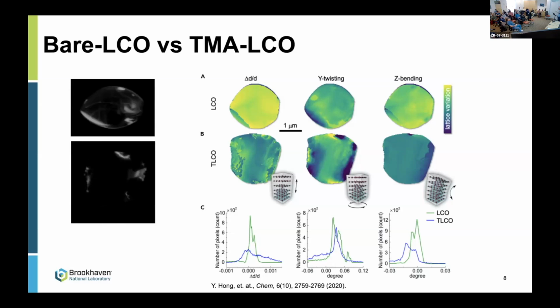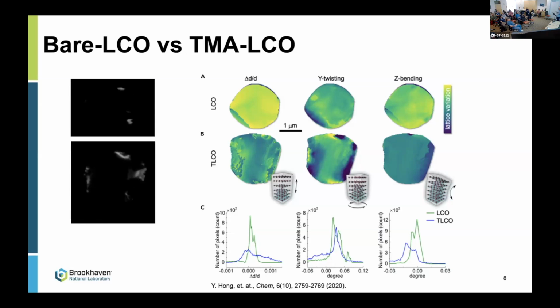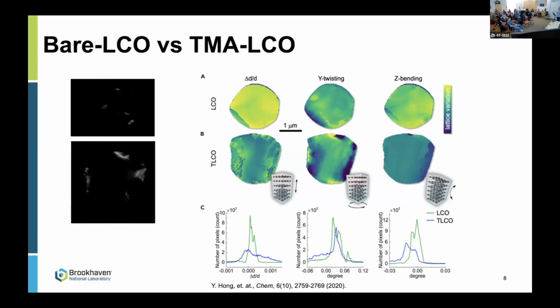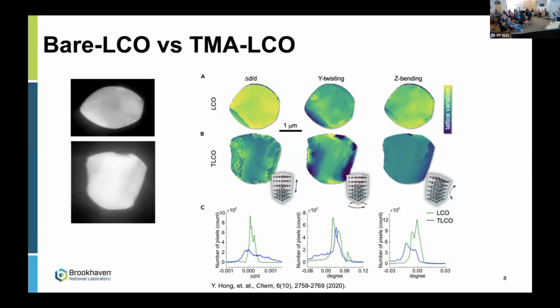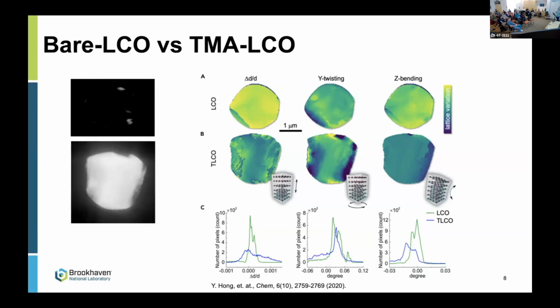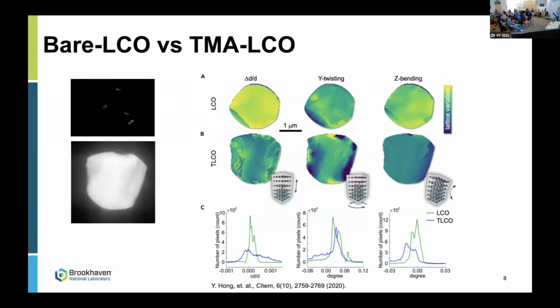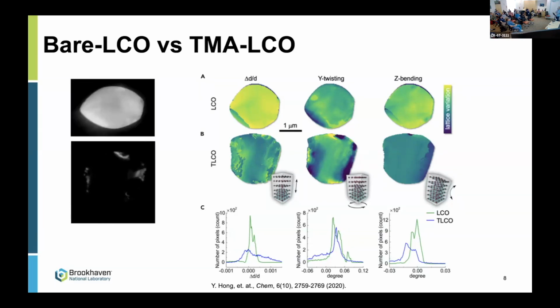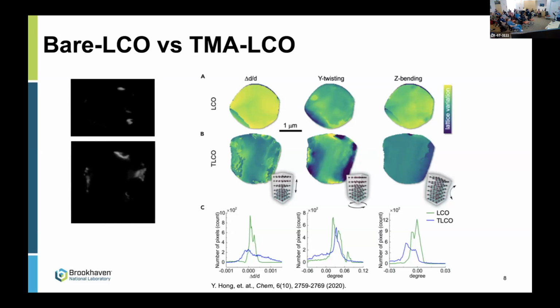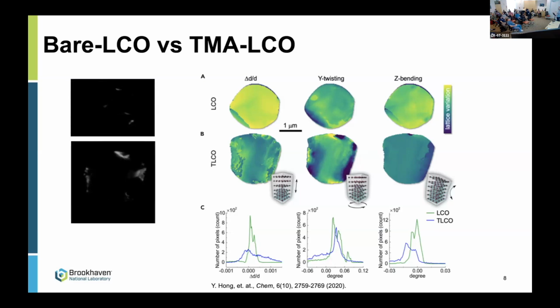Our colleagues did in situ powder diffraction measurements, and they found those preloaded strain fields actually suppress some undesired phase transitions during cycling, and that also helps to promote the electrochemical performance. And this result suggests that strain engineering could be another parameter to optimize the performance of this cathode material system.